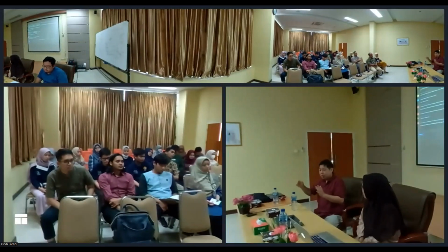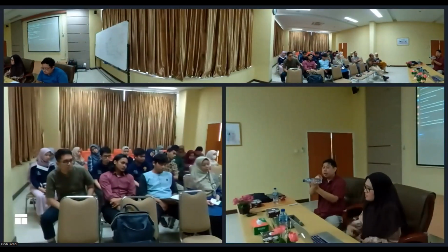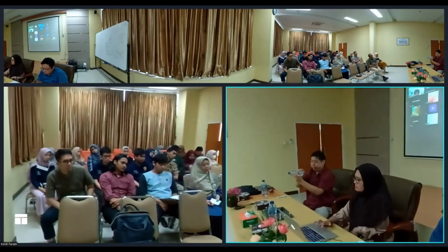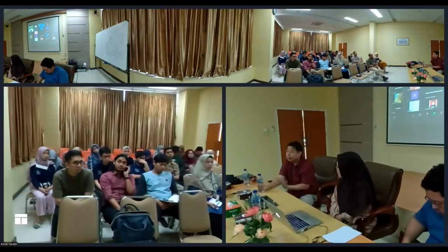When you are performing fragmentation at MS2, you shouldn't limit the mass range to 500. You need to limit it to 1,000. Just imagine that this is the 1,000 mass, with one charge over here and one charge over here. When you fragment and cut it into half, this section may be 800. If you limit yourself to 500, you will lose the product. You have to be careful.